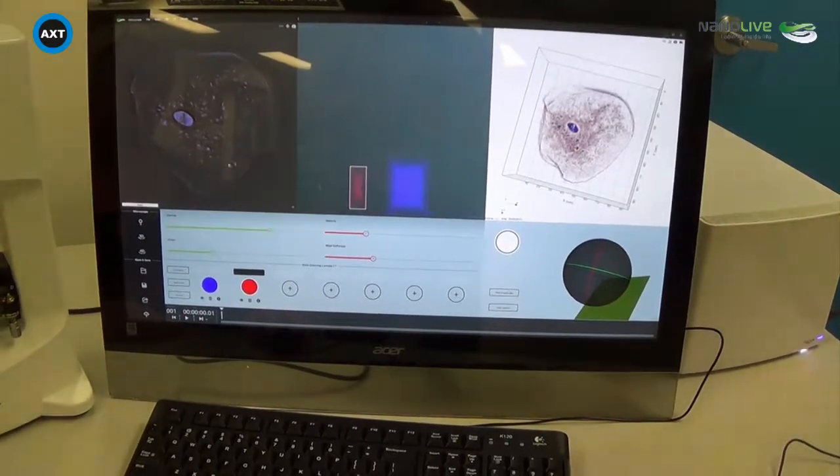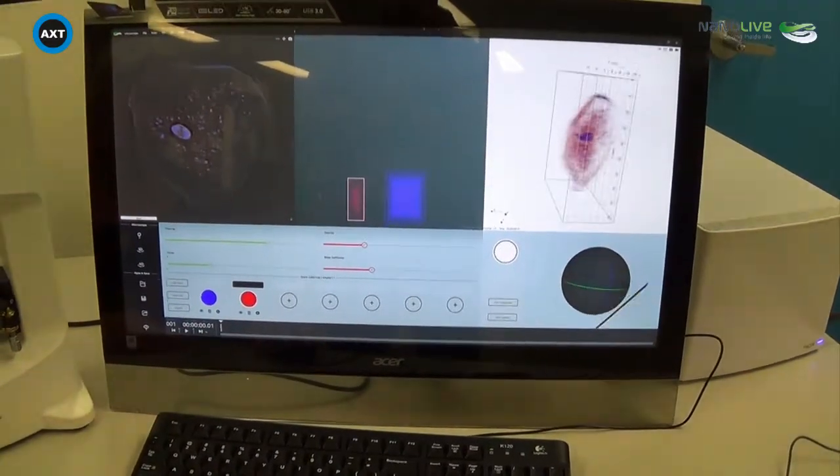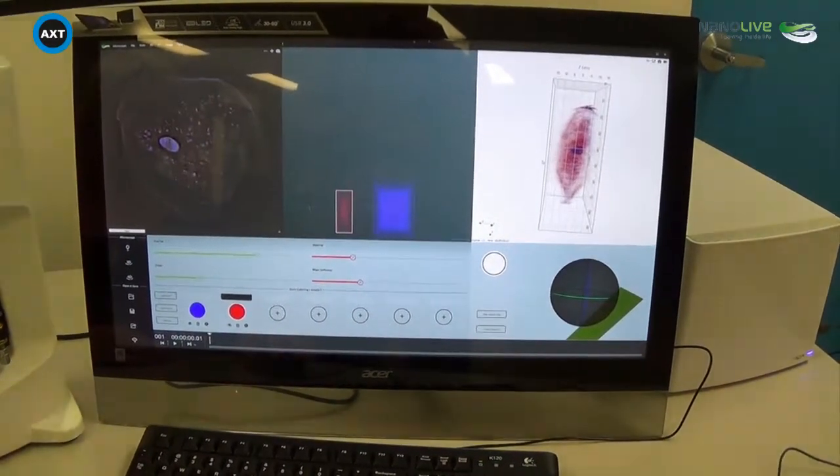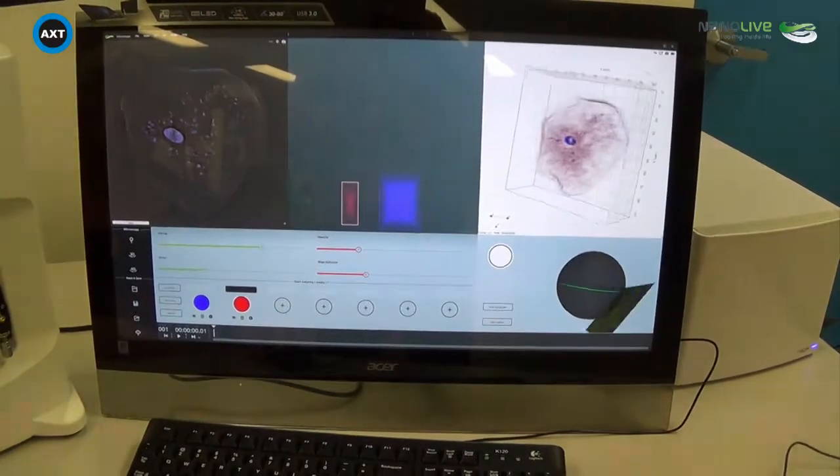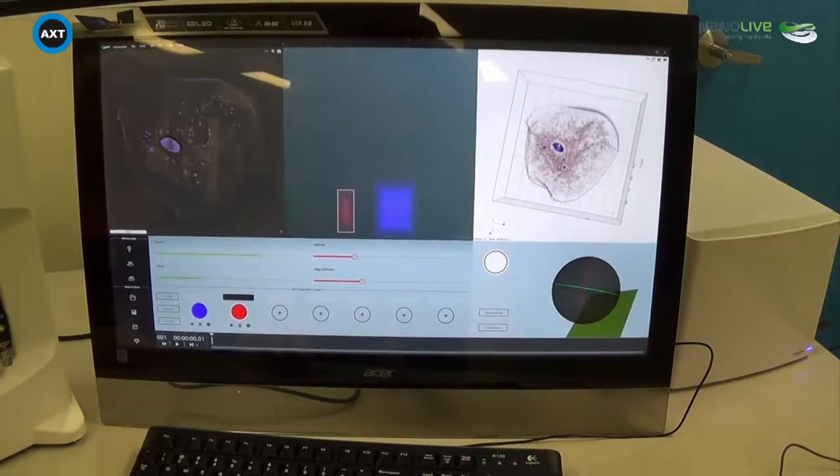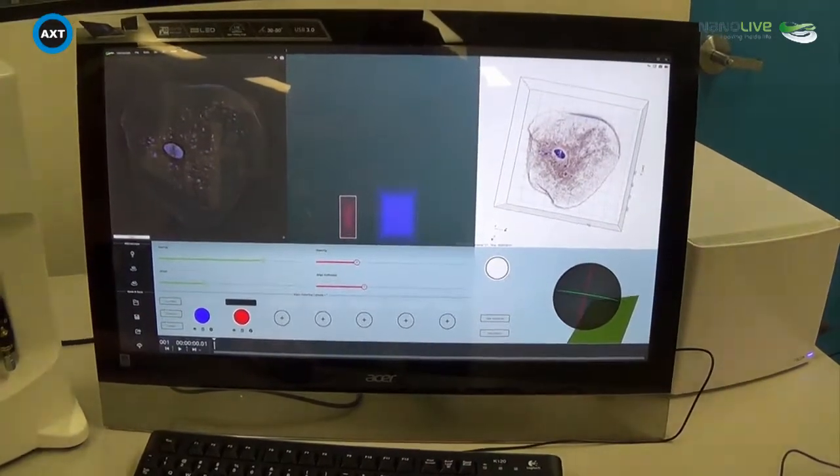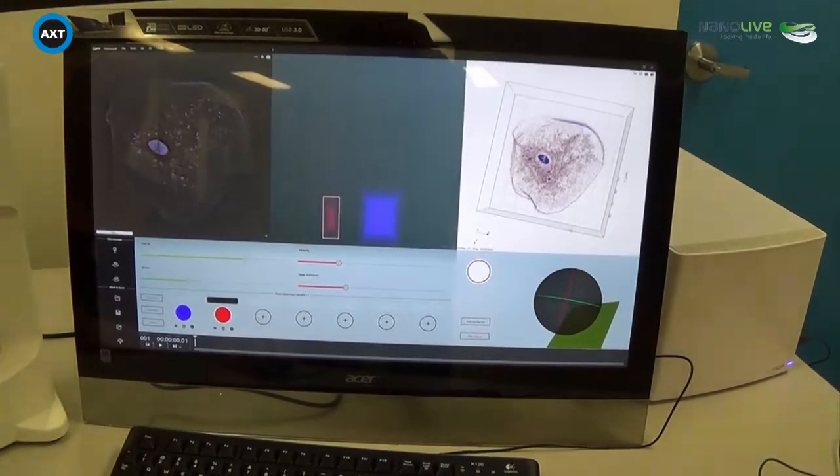because it is less than 30 microns thick, if we have a look, we can see that this cell is actually around 15 microns in thickness. So it's less than 30 if we're able to image it. So all cells or samples that you're imaging must be less than 30 microns.